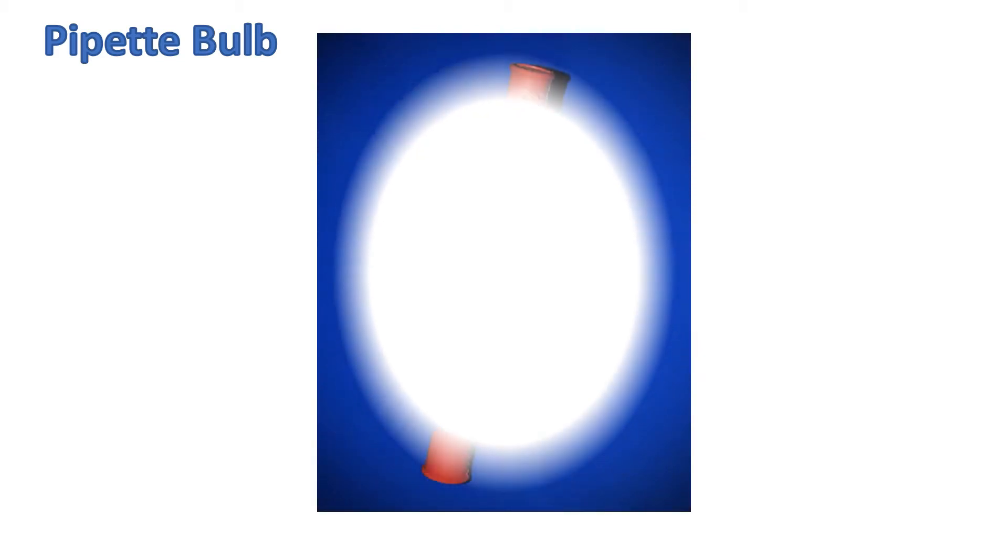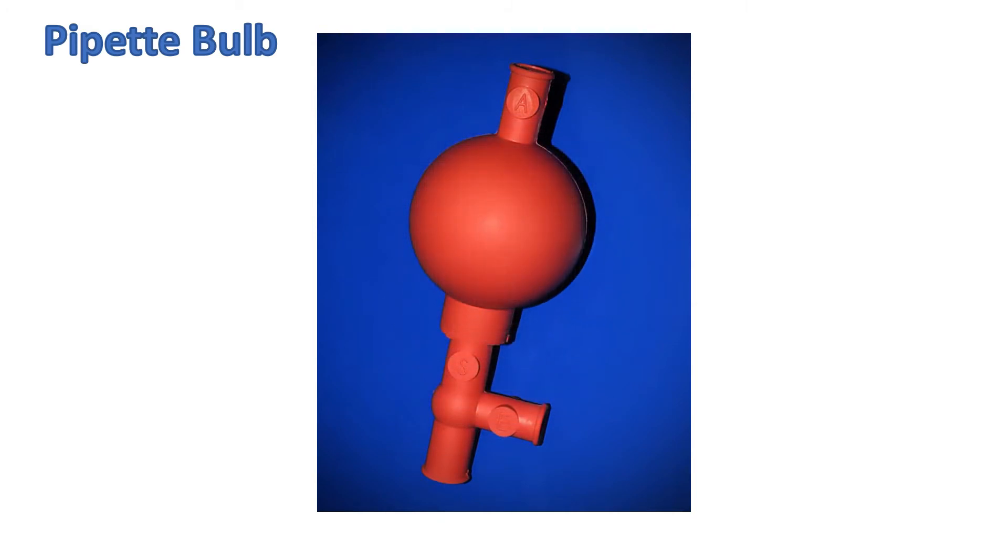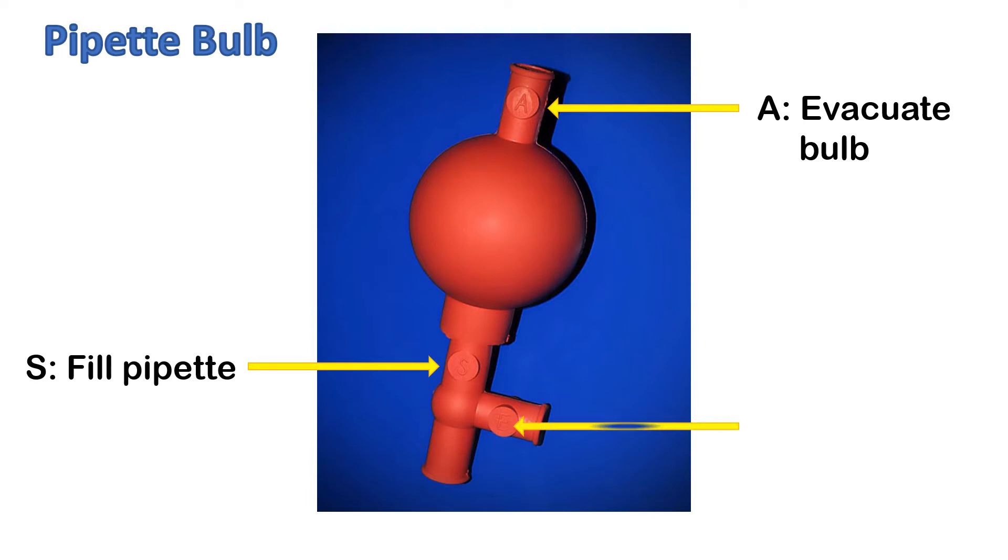There are three parts in a pipette bulb: S, E, and A. Press A and squeeze the bulb simultaneously to release the air out of the bulb. The S symbol is a suction valve. Press S to draw the solution into the pipette. The E symbol is for the empty valve. Press E to drain solution from the pipette.